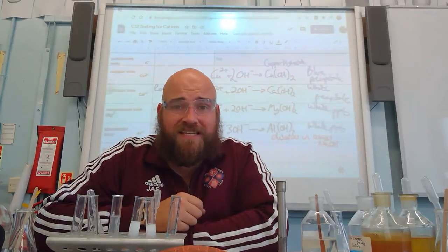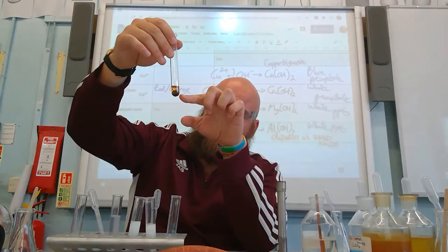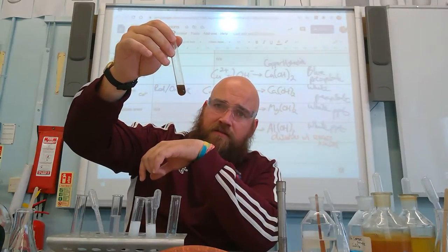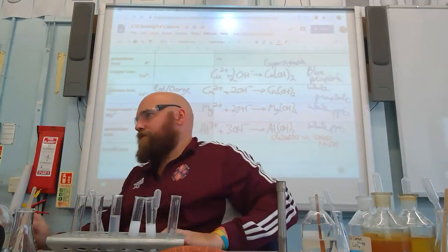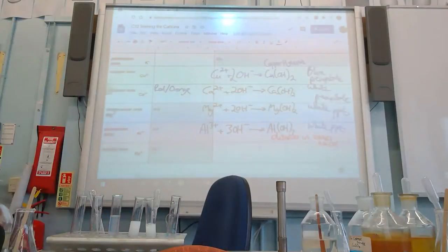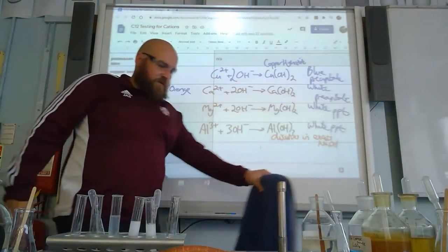And where is it getting this oxygen from? Well, it's the oxygen that's in the air above it dissolving in the solution. Yeah, so if you shake it up even more, you'll start to see it go even more orange. Okay, that's a bit of A-level chemistry there for you. So the last two then, we'll try and get these all on the same page so you can see it all. You have to go to the second page for the iron 3+ one.